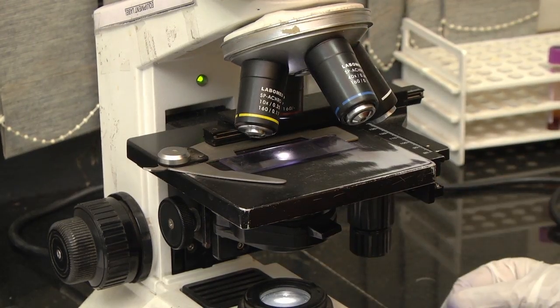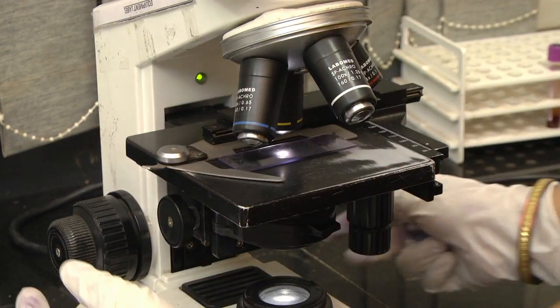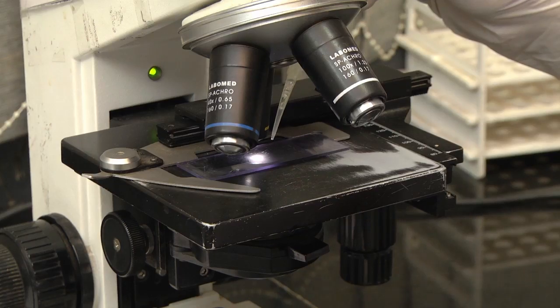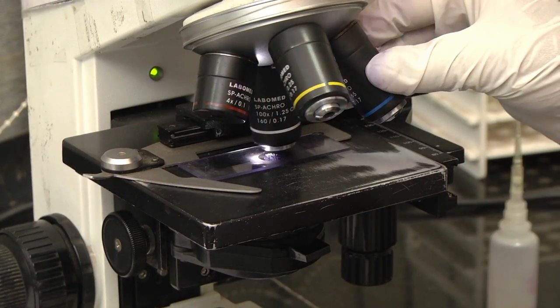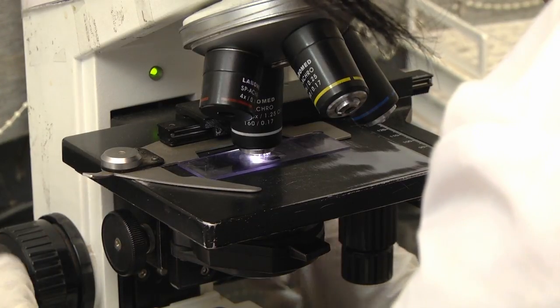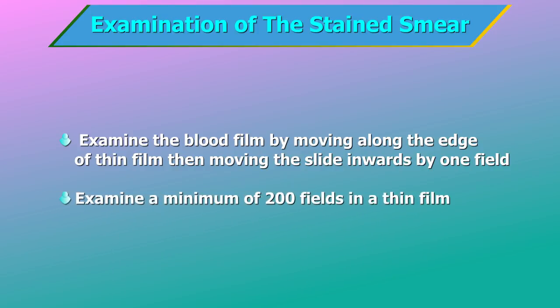Examination of the stained smear. Place the slide on the mechanical stage of the microscope. Focus the slide first using the 10x objective. Position the 100x oil immersion objective over the edge of the film where the red cells are thinner. Place a drop of immersion oil on the edge of the middle of the film. Lower the oil immersion objective until it touches the immersion oil. Examine the blood film by moving along the edge of the thin film, then moving the slide inwards by one field, returning in a lateral movement, and so on. Examine a minimum of 200 fields in a thin film.